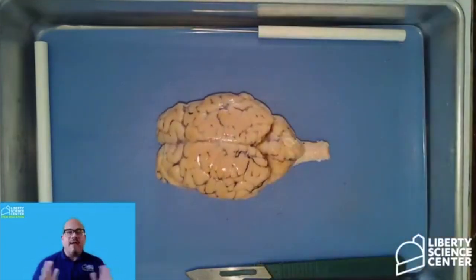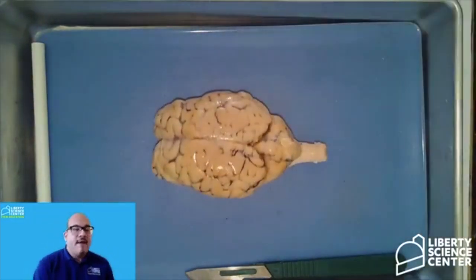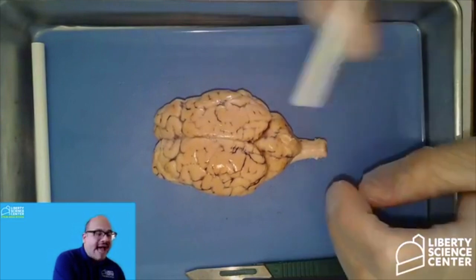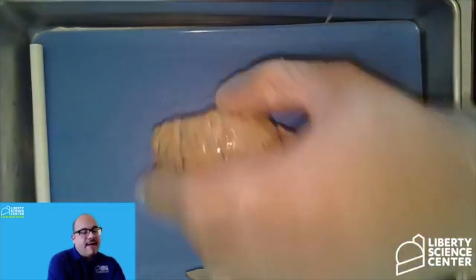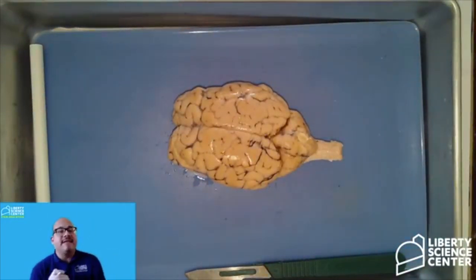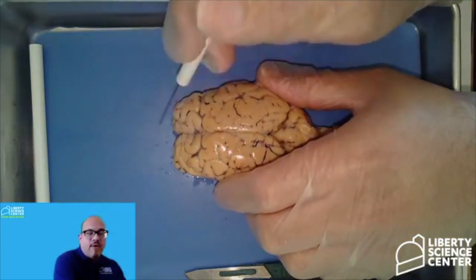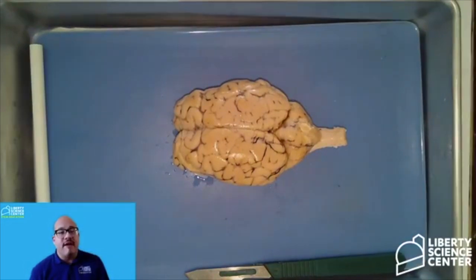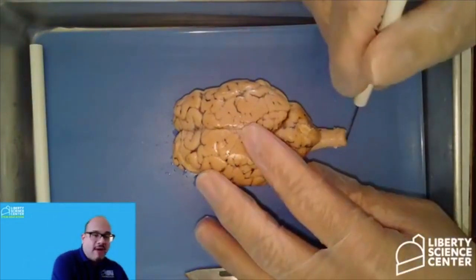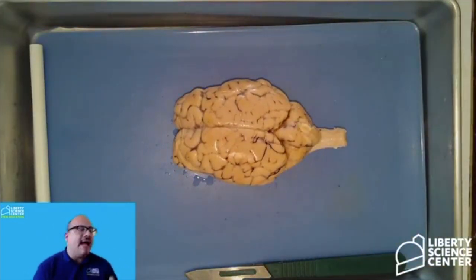Just before we even start the dissection, I want to give you a little bit of science facts in terms of positioning. So we have front, back, this part right here, and then the bottom part right here. When we dissect specimens, we like to use some scientific terms. When we talk about this area right here, the front of our organ, we call that the anterior portion of the organ. When we talk about this back portion here, we talk about posterior. So anterior means it's the front part of that specimen. Posterior means it's the back part, okay?